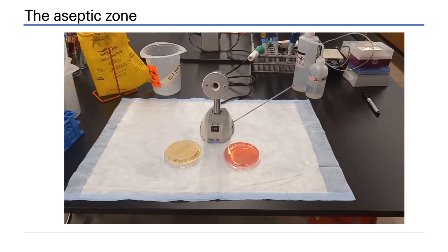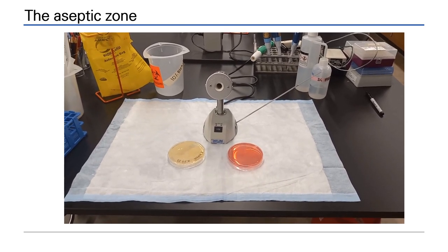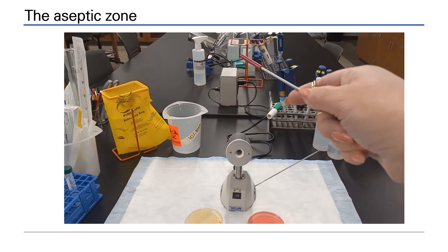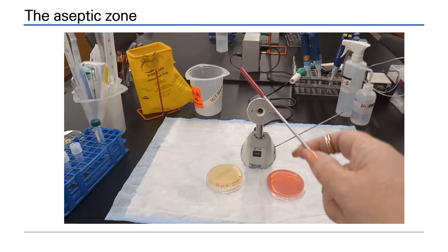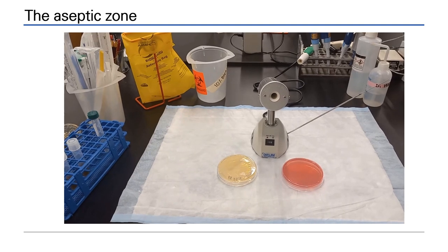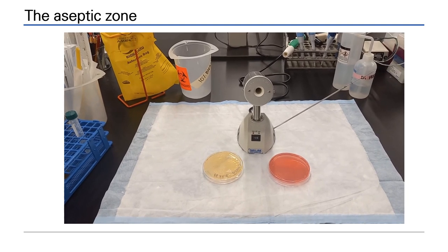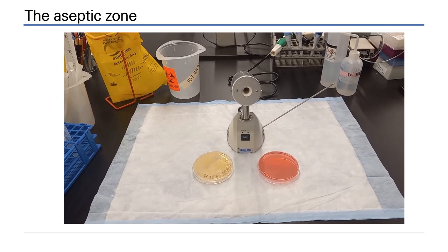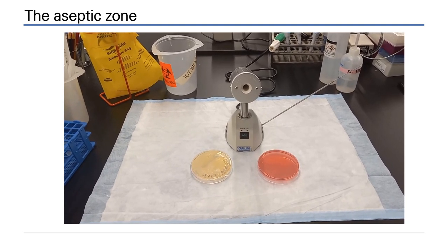An aseptic zone is used in microbiology to contain and control the movement of microbes whilst you work. The vaccinerator generates heat — hot air rises, moves to the side, and drops as it cools, moving pathogens out of your work area. The blue and white bench paper demonstrates the area generated by the heat of the vaccinerator, considered to be your aseptic zone. Within this area, microbes will be moved up and away from your work.